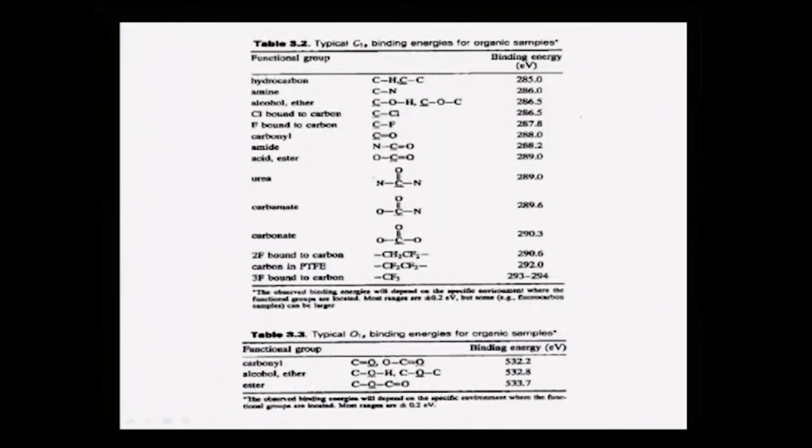These are some of the typical chemical C1s values, taken from books.